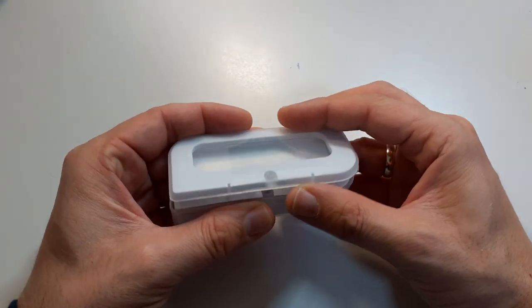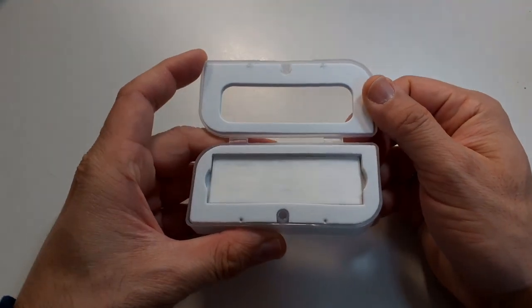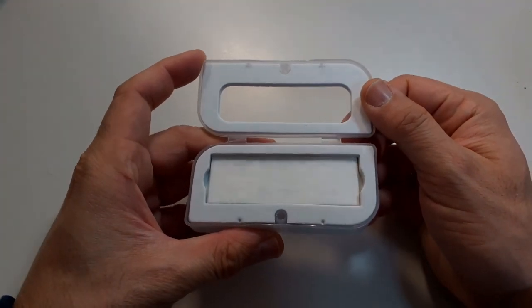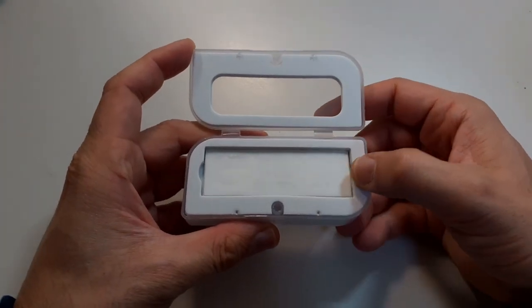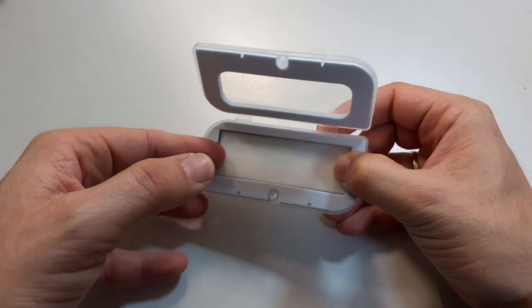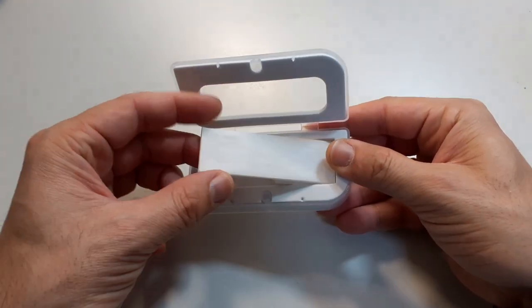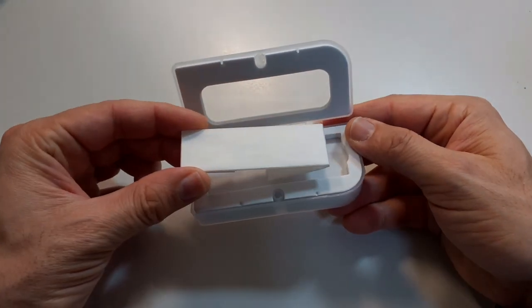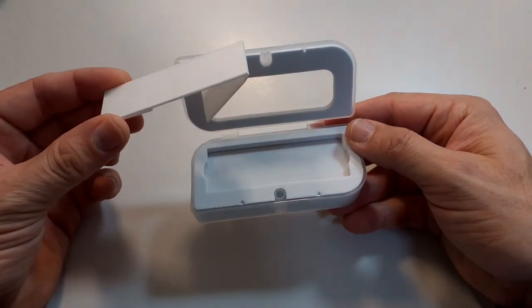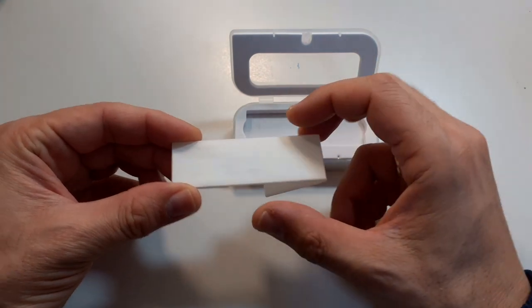Well, that's basically how it arrived. It was delivered in a small plastic box. There is a lot of foam padding around it for protection. The box is, as a matter of fact, much thicker than necessary, much larger than necessary, but that's okay.